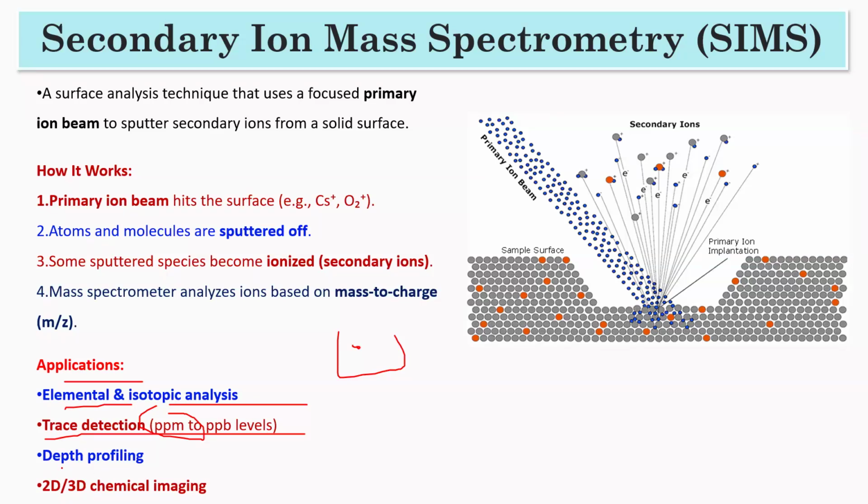So also you can do depth profiling. Profiling means, suppose first you analyze whatever was on the top surface, and then you remove that top surface and analyze what is in the layer below, and then again remove it and analyze what is below that. So it's very important, right? So yeah, that is the purpose.